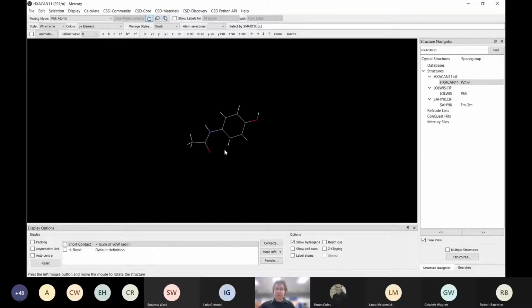So we have started with this molecule down here. Zoom out a bit so it's a bit larger. Hopefully you can see it. One of the other toolbar things is this style. So we have got wireframe, and wireframe is a very good basic way of being able to see your basic outline of the structure. It allows free, easy movement of your molecule, and often when things get more complex, using the wireframe, you might be able to see things that, when you go for the later styles which I'm about to show you, can be a bit more complex. However, for actual diagrams, it's often a bit plain and difficult.